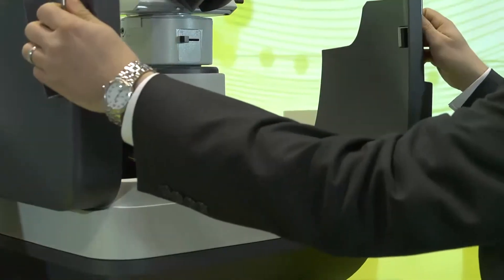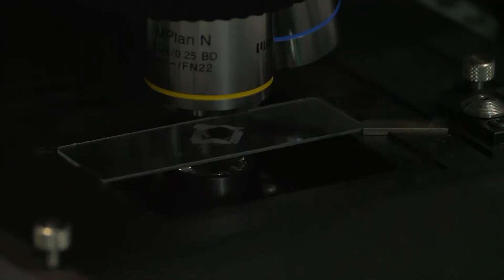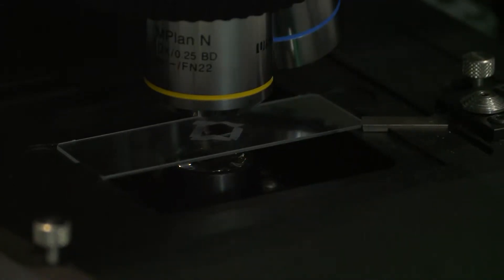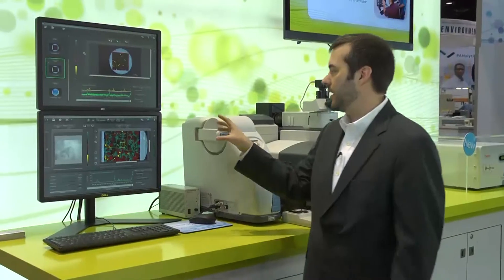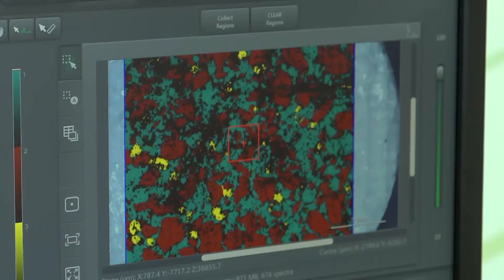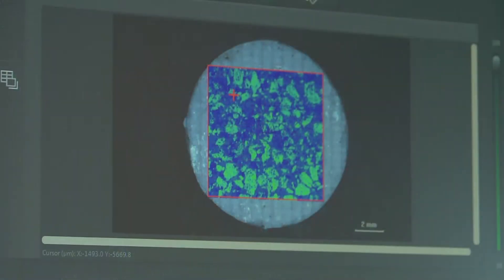So we've produced an instrument that's extremely easy to use. Anyone can walk up and it's as simple as placing a sample, looking at the instrument to first optically identify areas of interest, and then immediately going to Raman image data to really stream spectra off, but to provide a visual interpretation in a real-time context.